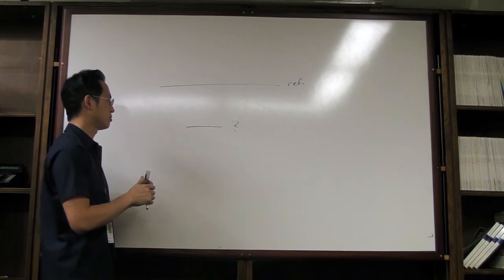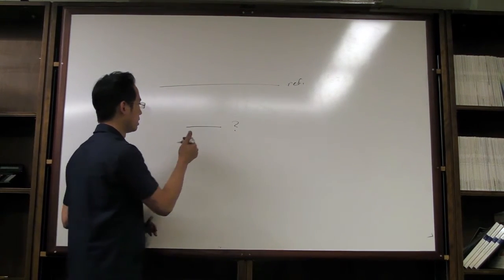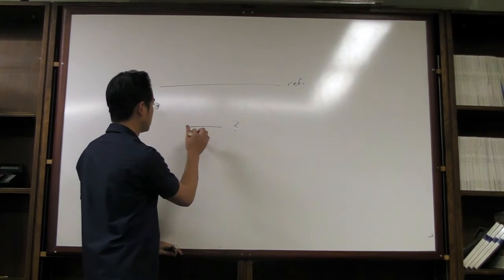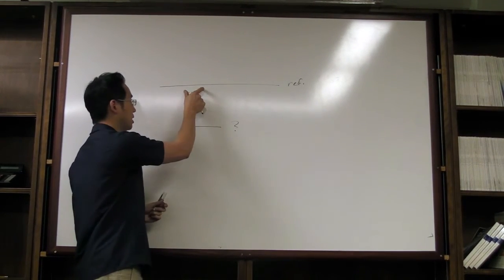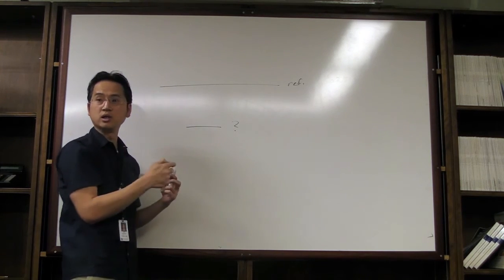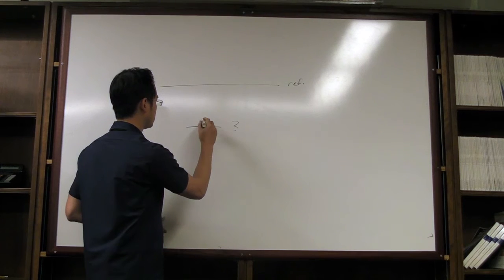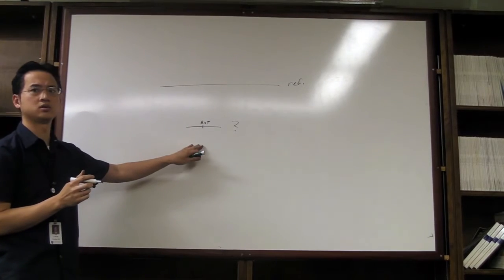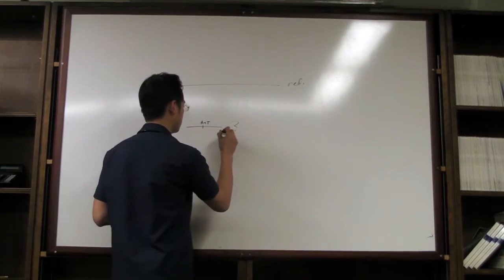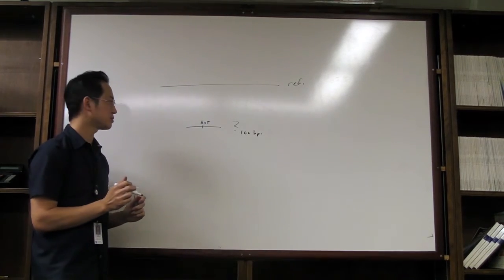So most people, the way they do it, at least CLC, the way they do it, is you basically take this and you set certain criteria to say this matches my thing or not. And it really depends on what you're trying to look for, right? So let's say you're only trying to look for some SNP right here. So it's an A to a T, for example. So not a huge change here. And let's just make it easy. This is a 100 base read length.